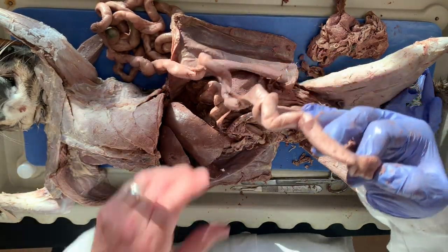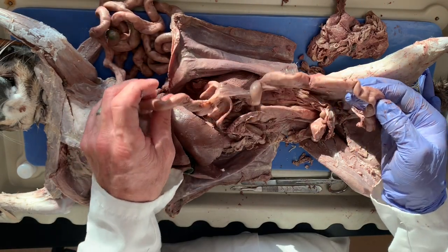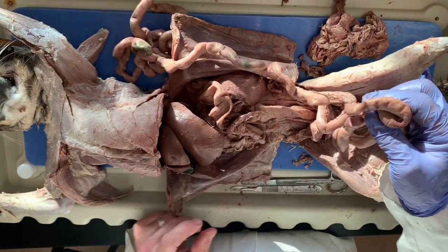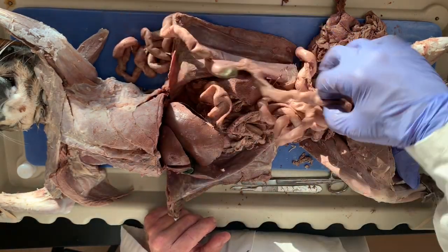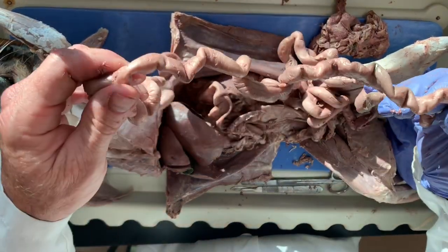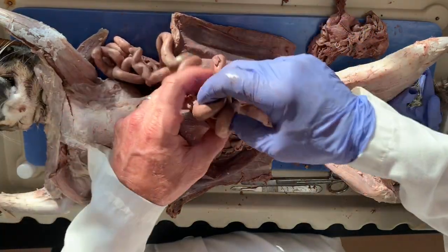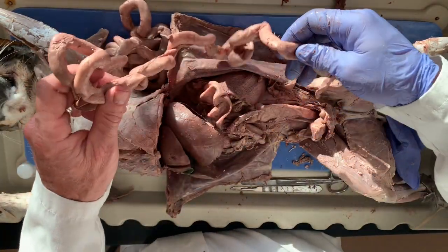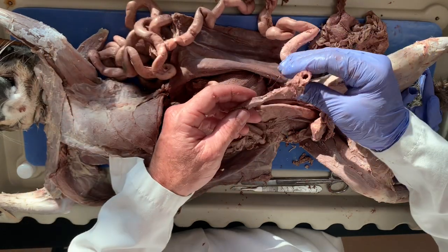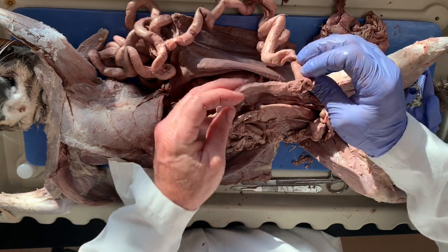And it actually is longer in other organisms. Since the cat is primarily a carnivore, it's relatively short. When we dissected rabbits last year, rabbits are herbivores, and so they have a much more extensive small intestine because they have to digest all that grass and plant fiber, okay? So you can see at the end, this is part of the pancreas that's attached to the duodenum. Again, it's not terribly distinct.